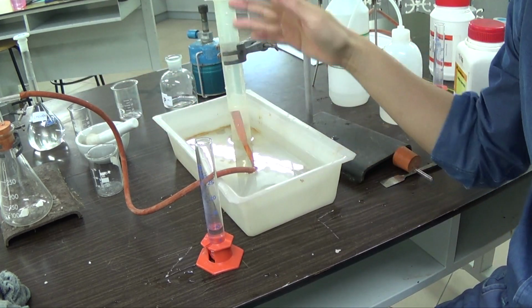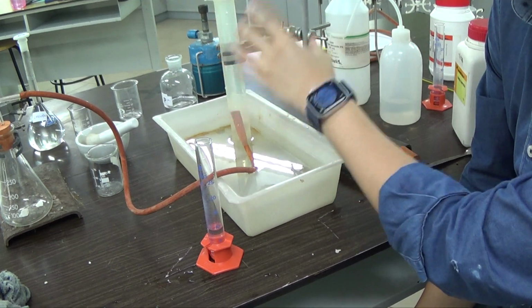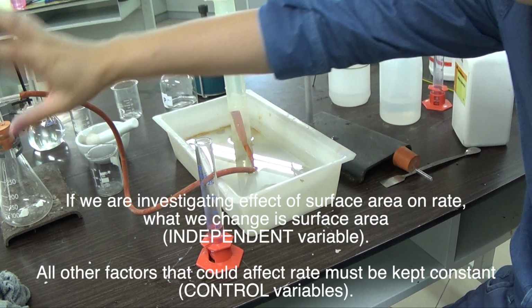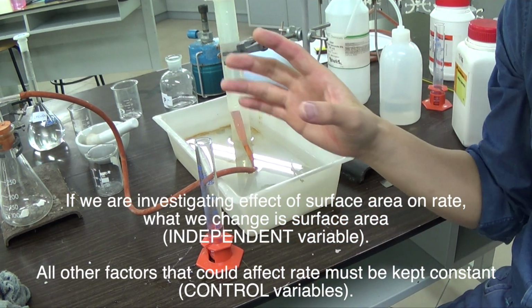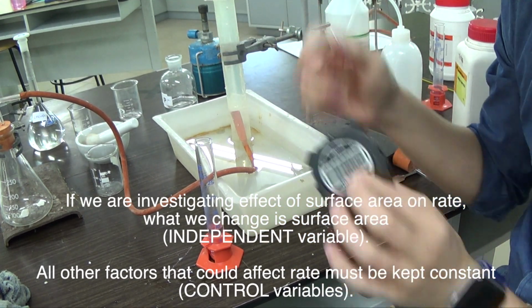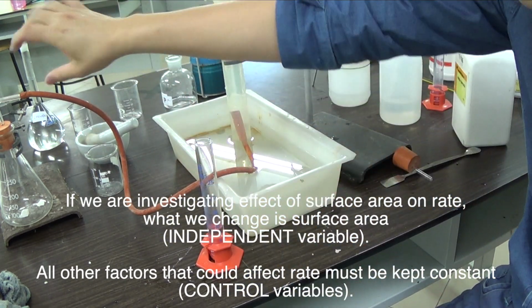I'm doing a collection of gas. I want to see how much gas is produced, how much gas is collected after a fixed time, comparing the lumpy form versus the crushed powder form. Another way is to monitor the time for a fixed volume to be produced.